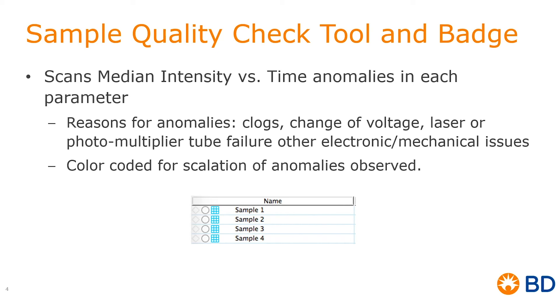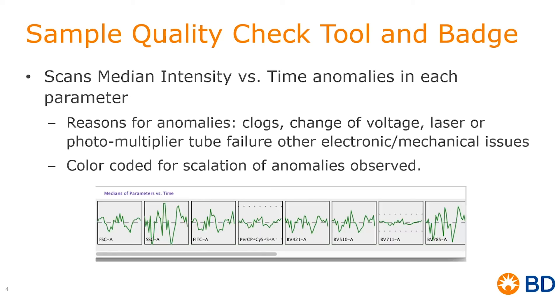If you go ahead and double click it, what you're going to get then is this representation of the medians of the parameter versus time that I was mentioning that FlowJo uses to check for the quality of your sample.